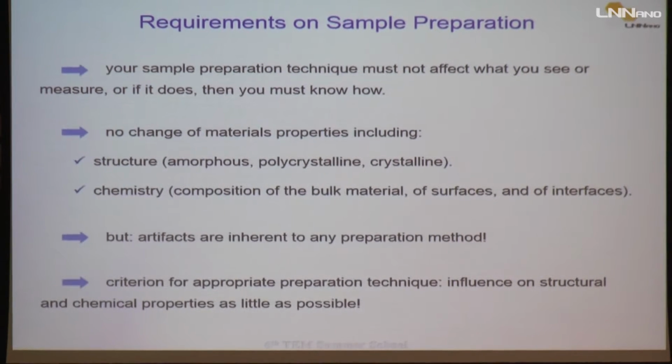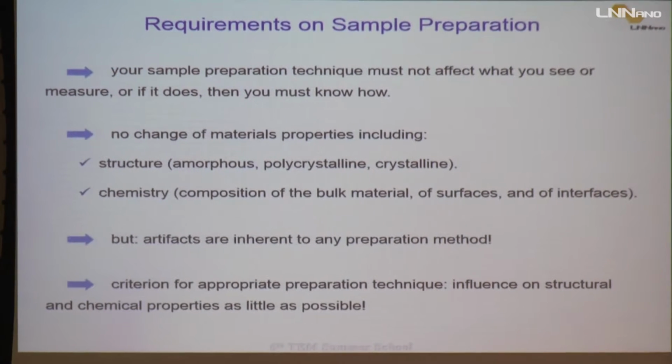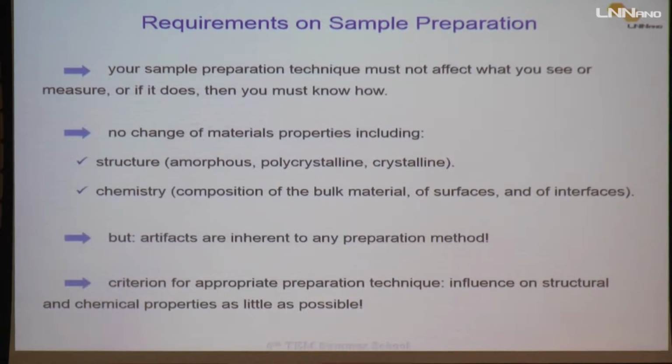If I have a part of bulk material and I want to do microscopy, I will need to cut it to make it thin, and I will apply a lot of force, and perhaps I will change the material.